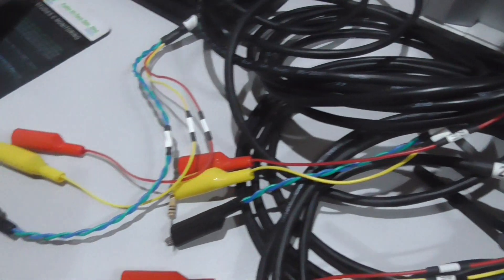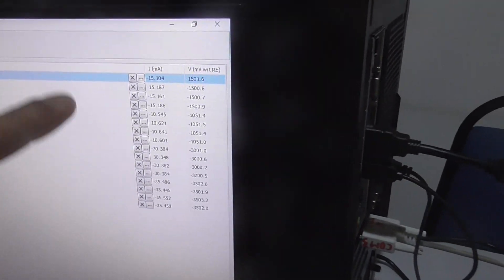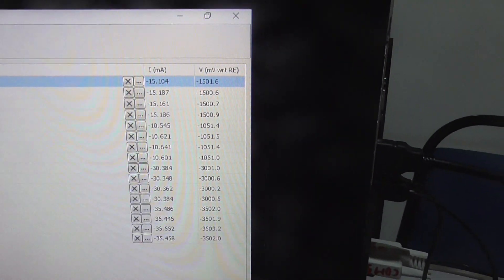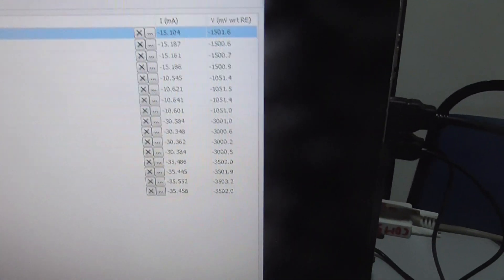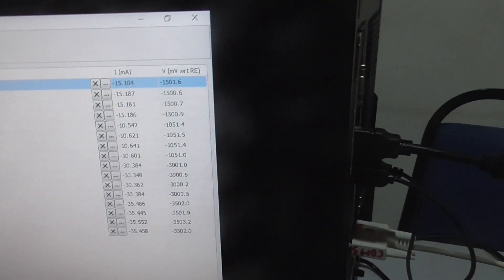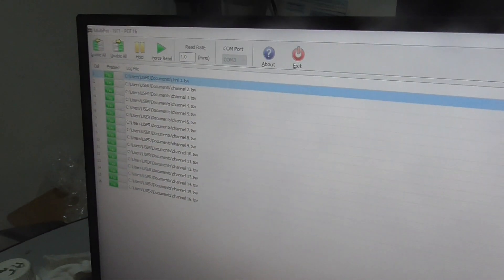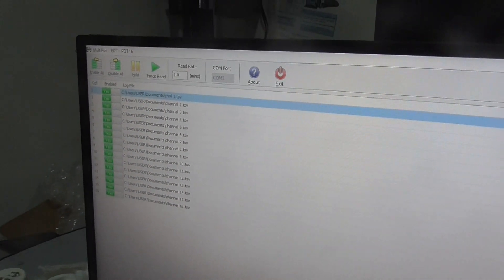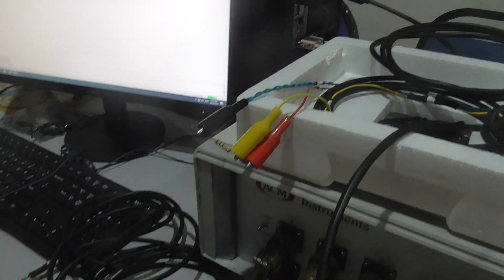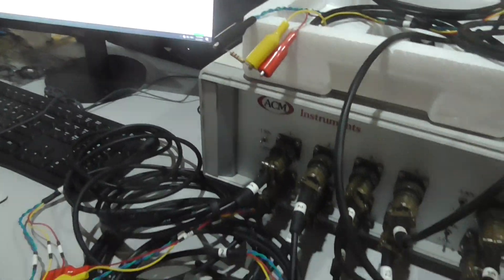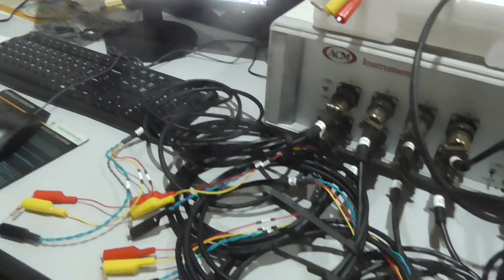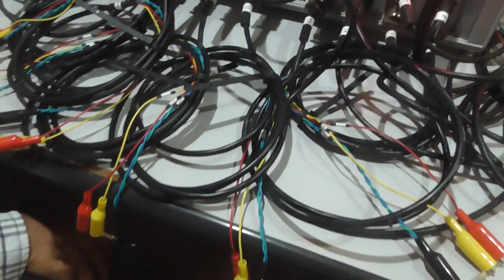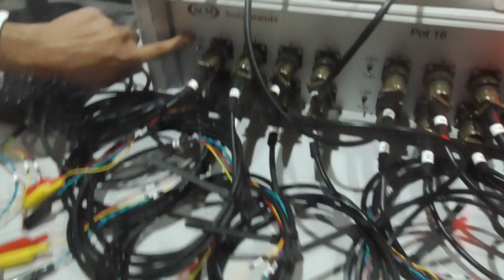It will show in the result over here. It will take a measurement every second and then it will have reading data for the whole measurement continuously until you stop it yourself.